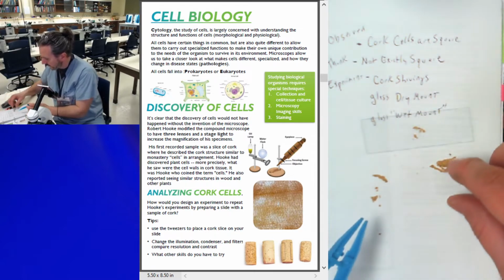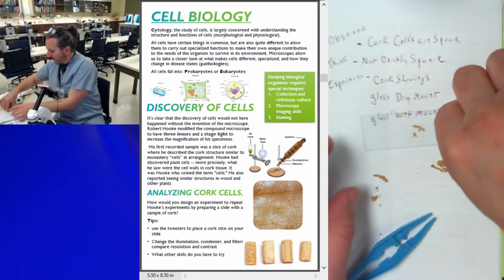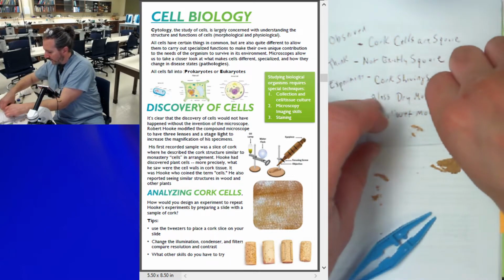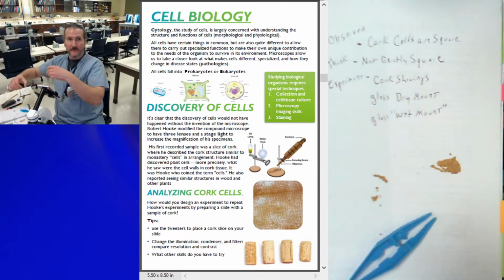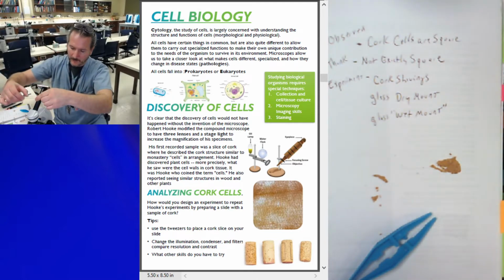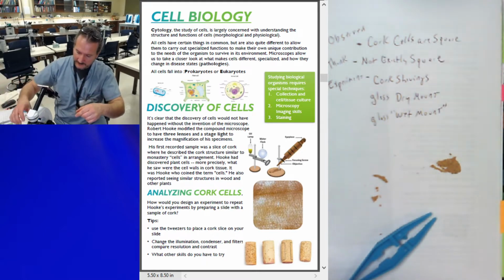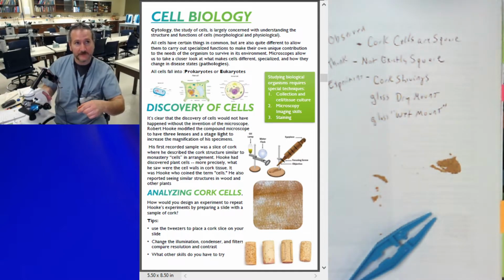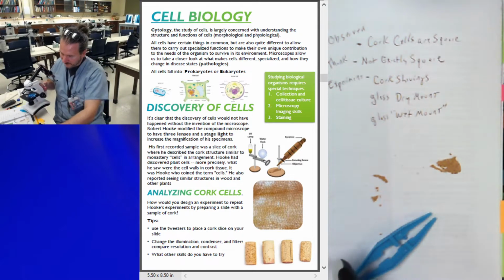I just want some of those thin ones because I'm going to put some drops of water on it in a few minutes. So I'm going to check it out. Dry mount first. Alright, I'm going to bring it down, make sure that my red scanning objective, if you don't remember, red scanning, I guess I could bring this over here so you can see a little bit better.